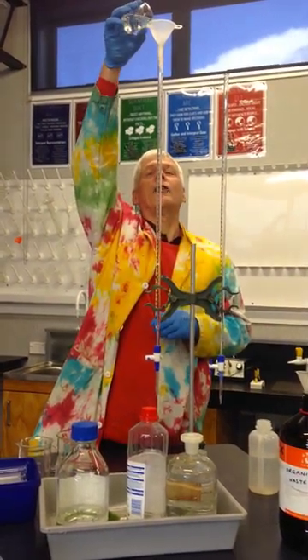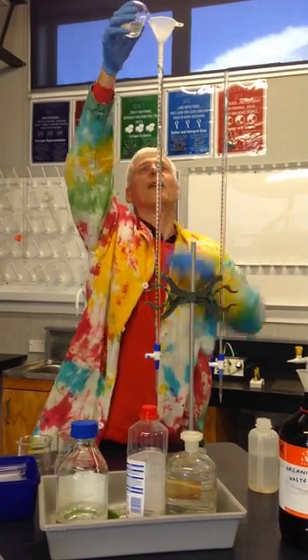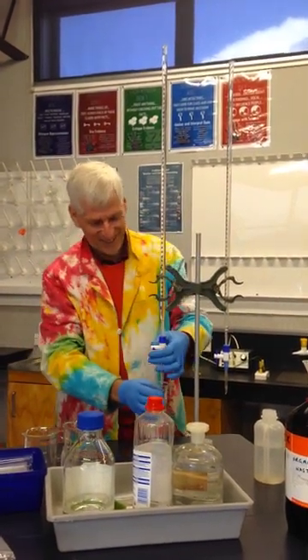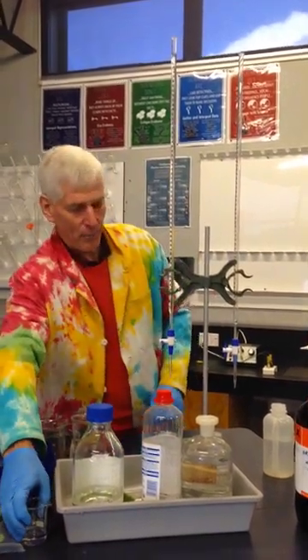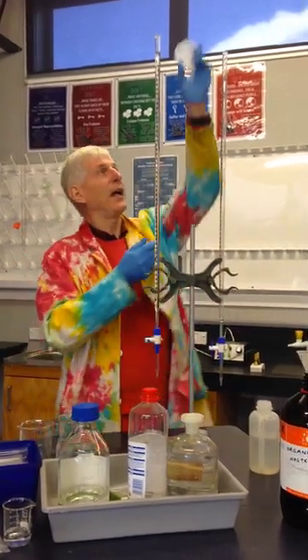And titration is something that you'll get used to later in the year, and you'll be using one of these burettes, and you don't want to do what I just did then. And in the other burette, I'm going to put hexane.